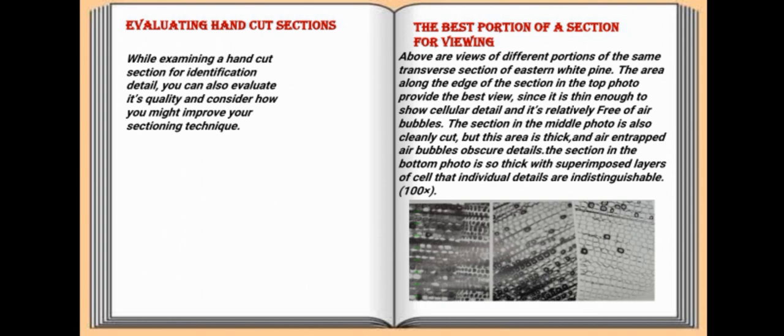The best portion of the section depends on several factors, including the type of sample, the orientation of the section, and the level of detail needed.